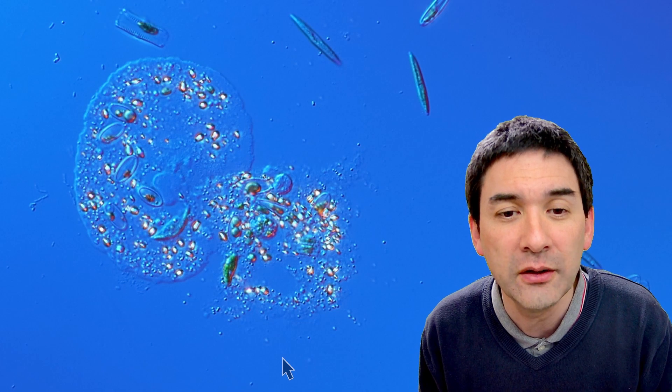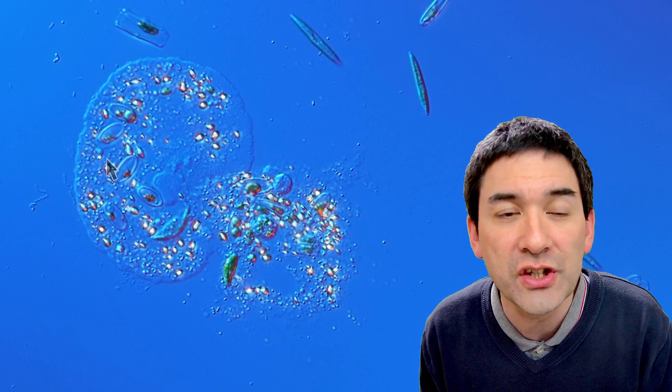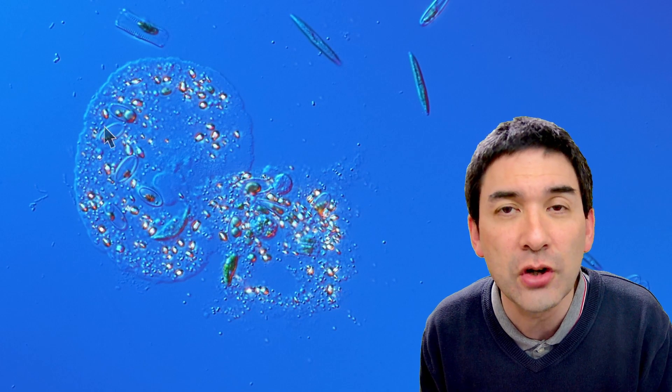And let's turn on the arrow, and what you see over here all of those green little structures and oval structures that you see here, these are diatoms.